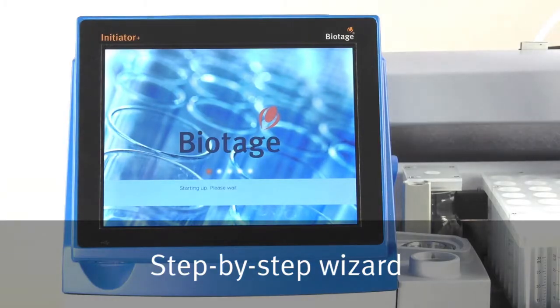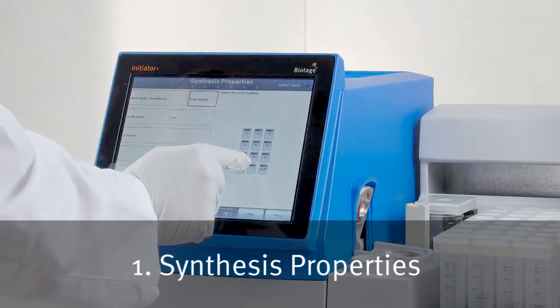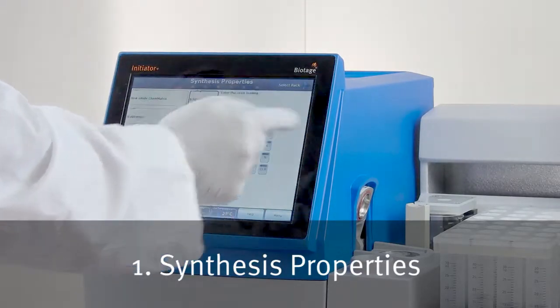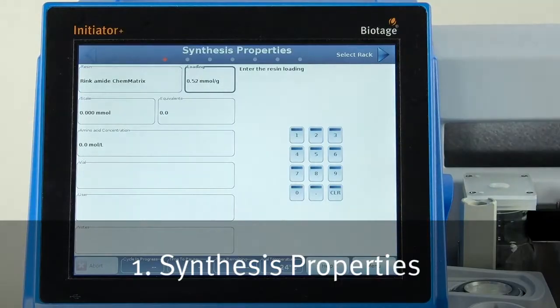Programming a synthesis using the built-in wizard can be done in seven simple steps. In synthesis properties, select the resin and enter the synthesis parameters for scale, equivalence and amino acid concentration.